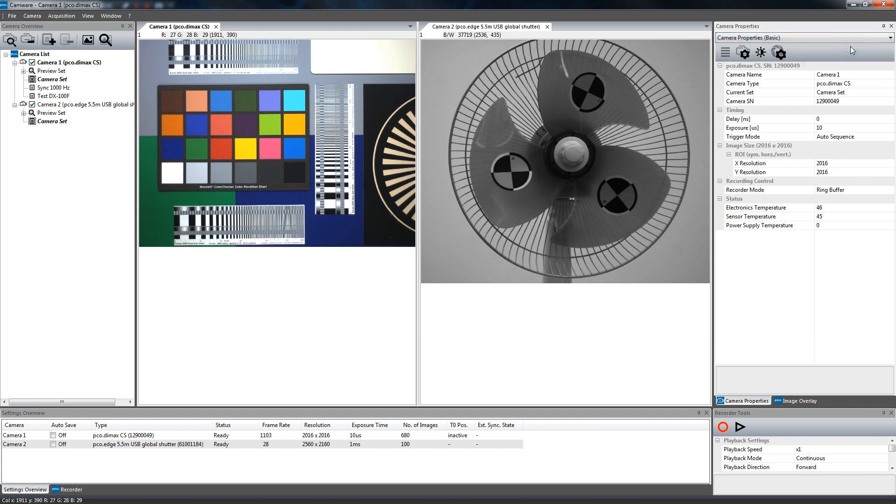The Basic mode only shows essential camera settings such as exposure time. This mode is recommended for those who are new to our cameras and do their first steps.